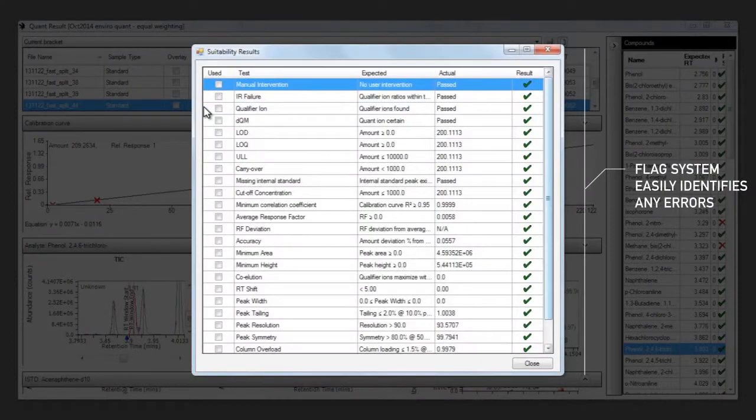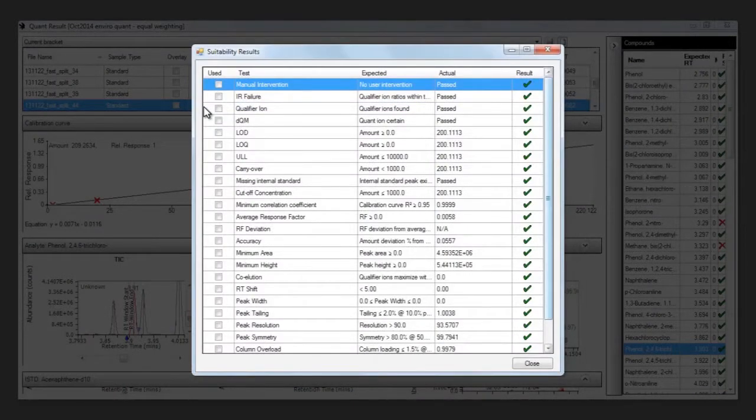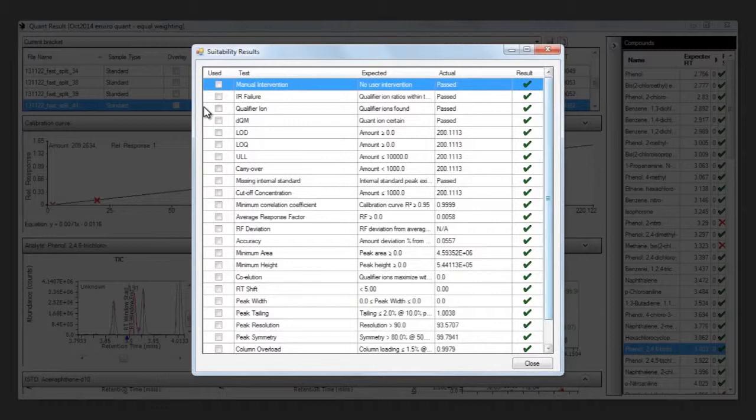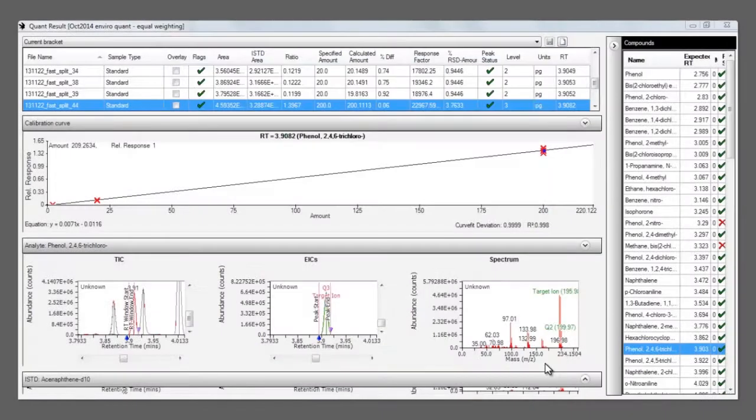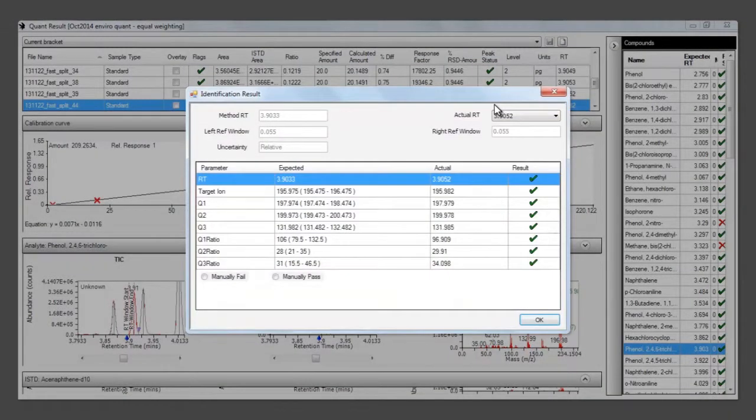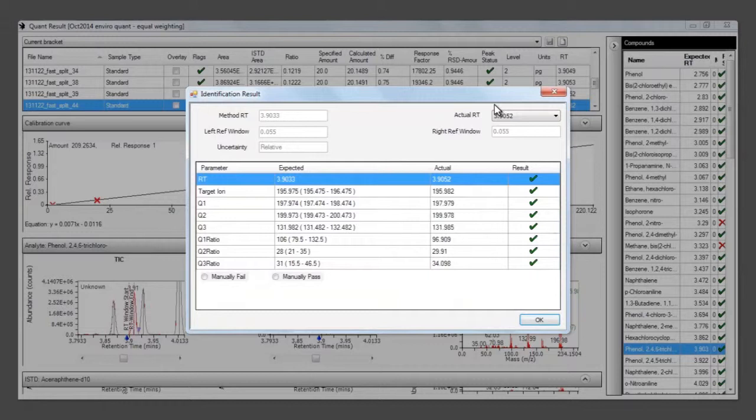The suitability flags highlight any peaks which have failed to meet the set criteria with a red cross, instead of a green tick. The same goes for the identification flags, where you can see if the quantifier and qualifier ions are present, and if the ratios are within the specified limits.